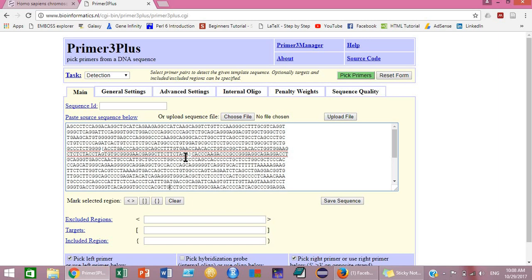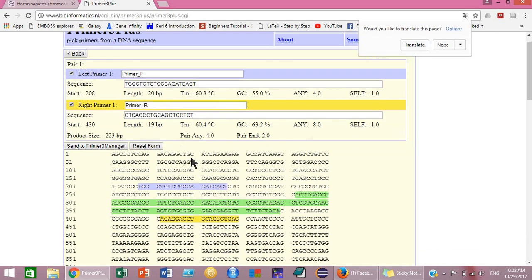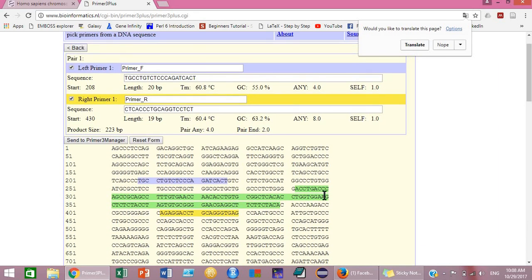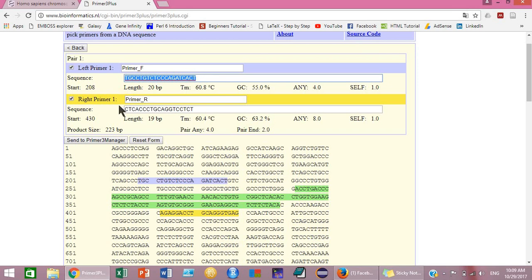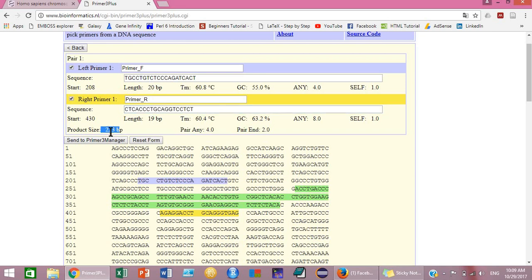Even if you select only the target region, that's enough for designing your primers. After selecting your target region, just click the 'Pick Primers' button and your primers will be designed. This is your target region, this is your forward primer, and this one is the reverse primer. The sequences, length, product size (223 bp), melting temperature, and GC content for both primers are given here.